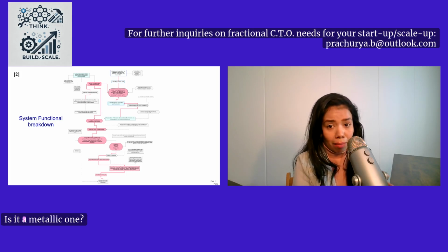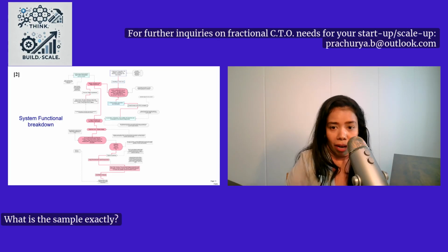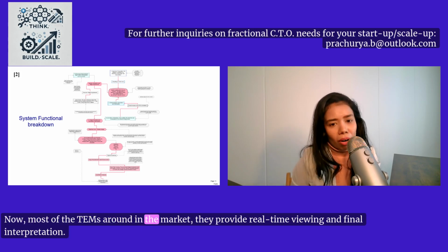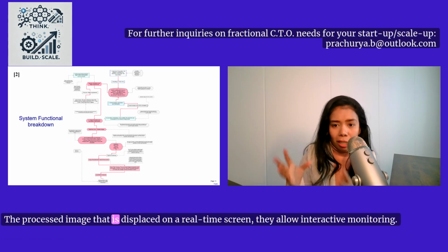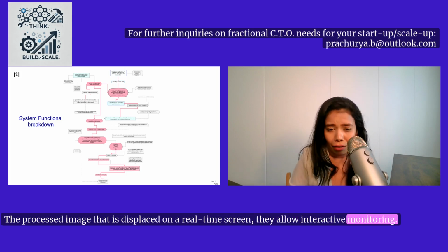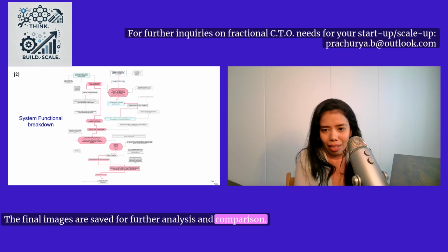Is it a metallic one? Is it a biological one? What is the sample exactly? Measurements such as distances, angles, and atomic structures are primarily extracted when you look at the quantitative analysis part of it. Now, most of the TEMs around in the market, they provide real-time viewing and final interpretation. The processed image that is displayed on a real-time screen allows interactive monitoring. The final images are saved for further analysis and comparison.